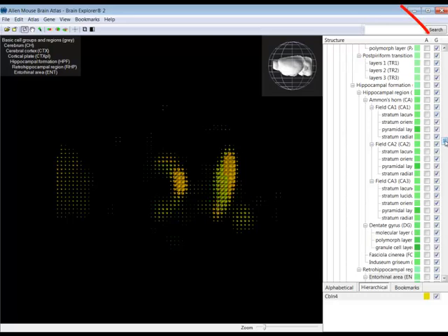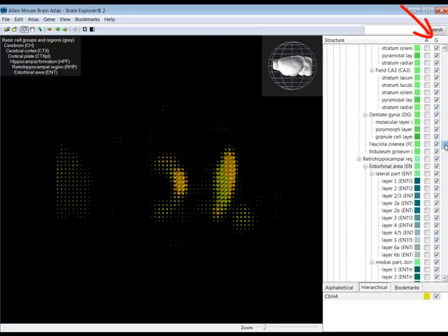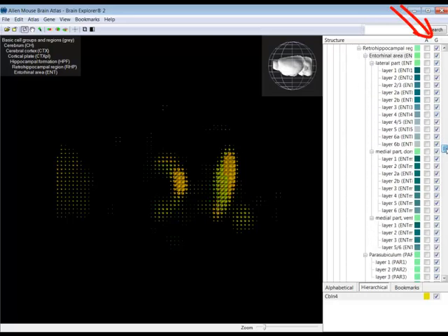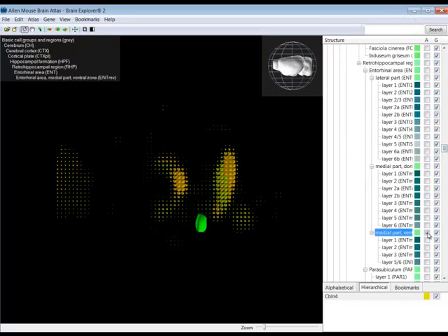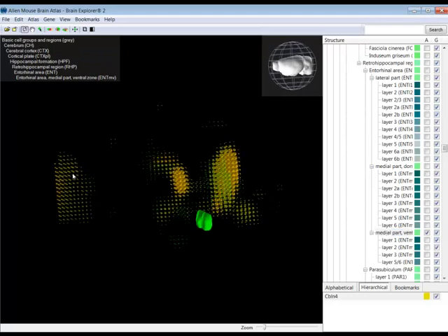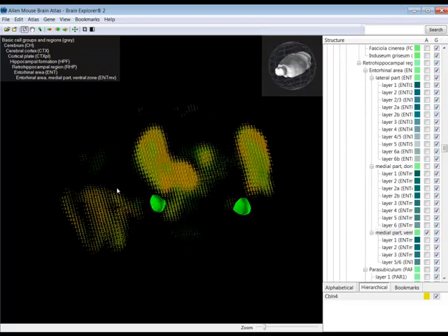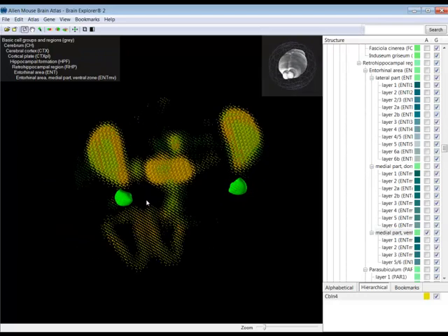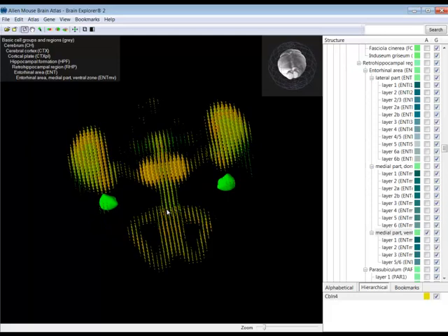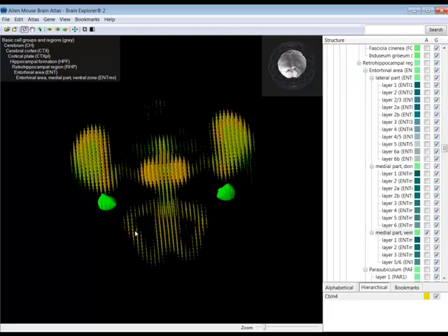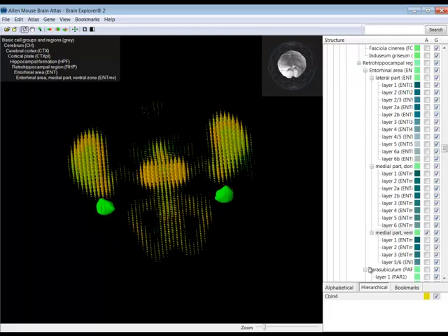The two columns next to the structures are G for Gene Expression and A for Atlas Structure. Gene Expression is turned on in the entire brain, indicated by the check marks. And you can turn on the reference atlas structures by clicking next to that structure in the A column.